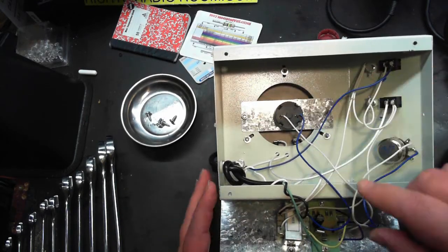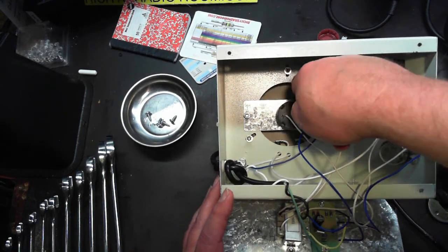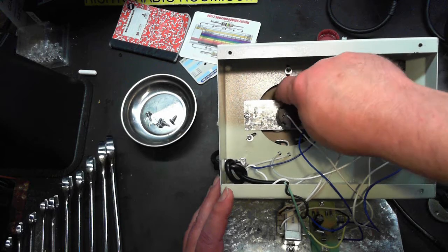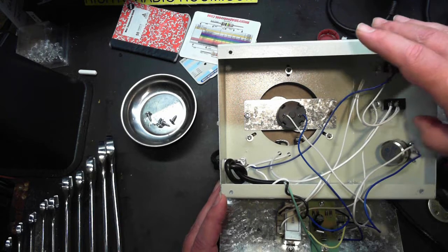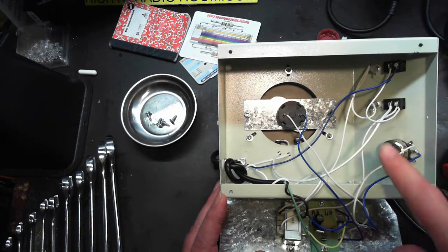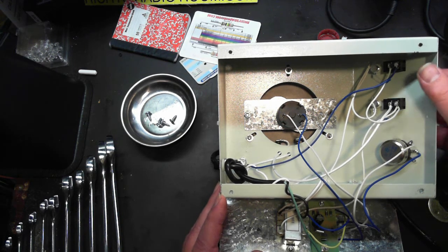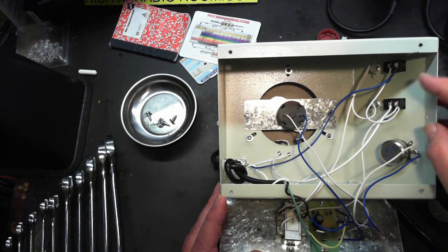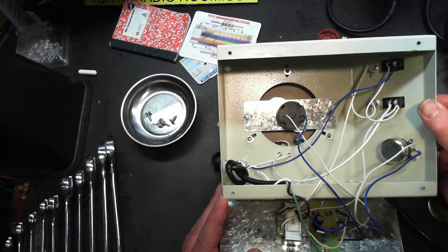there's your magnetized motor. Little bar spins around. Two switches. Little resistor for the switch. I was wondering if there was some kind of thermal protection that was keeping this off. Oh, it's this switch here. Yeah, the switch is gone. Gosh darn it.